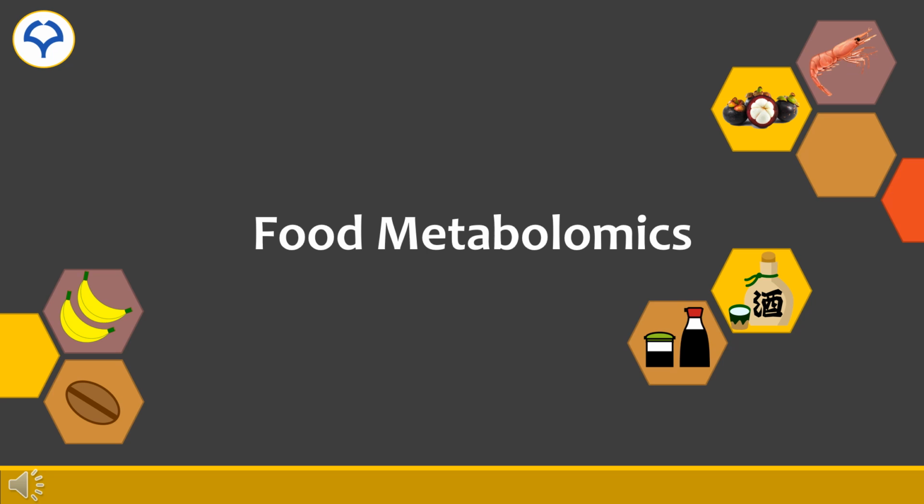I would like to introduce the food metabolomics research conducted in the Fukusaki laboratory. Food metabolomics is a field of study that applies the metabolomics method, which analyzes components, to the food sector.